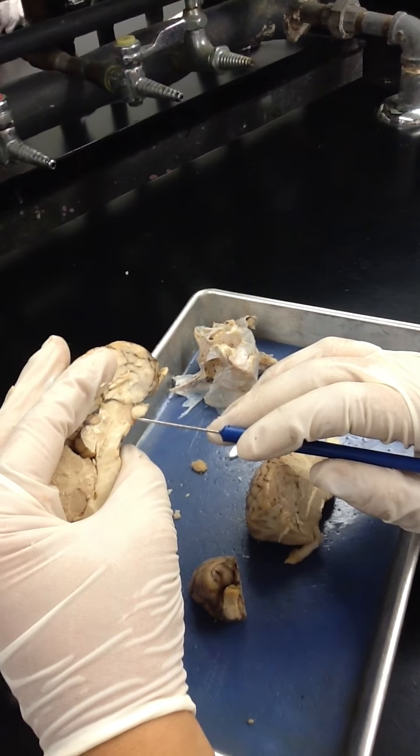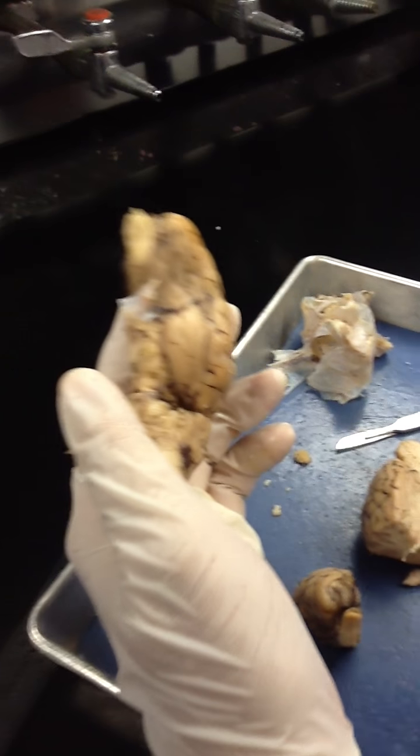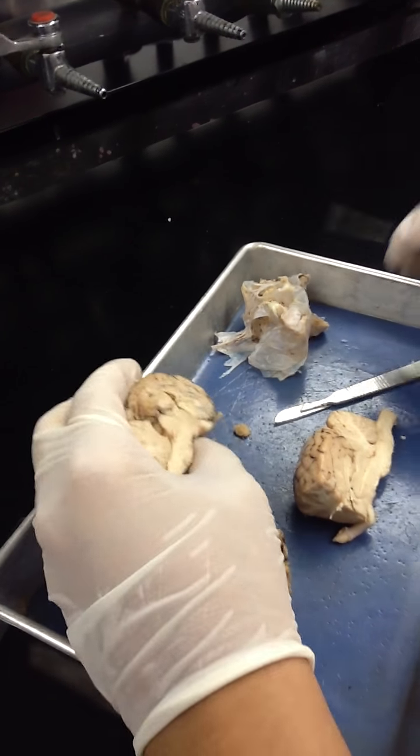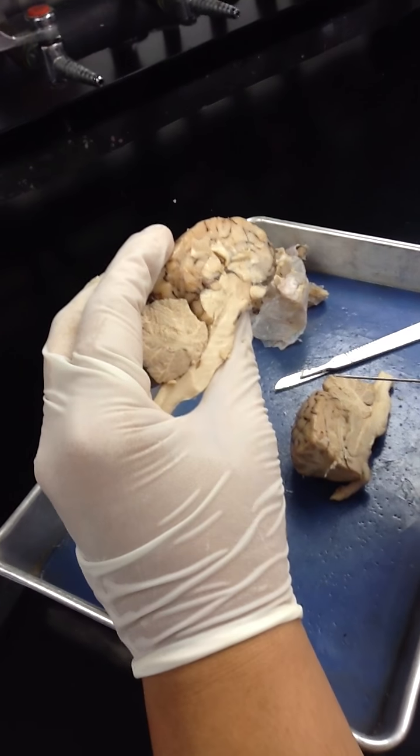Beautiful. That's not going to be on the practicals. It's too small. It's too hard to point to that particular structure. I usually just answer nucleus.